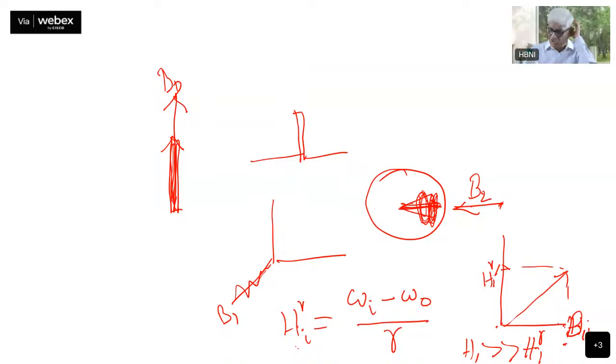Of course, you may also ask, what is the meaning of applying a pulse along the x or the y-axis in the transverse plane? What is the physical meaning? This is basically a phase relationship between the RF and your receiver. You take the receiver as 0 phase, and whatever is along the x-axis or the y-axis is relative to the receiver phase. The phase difference between the receiver and your RF is what is called the phase.